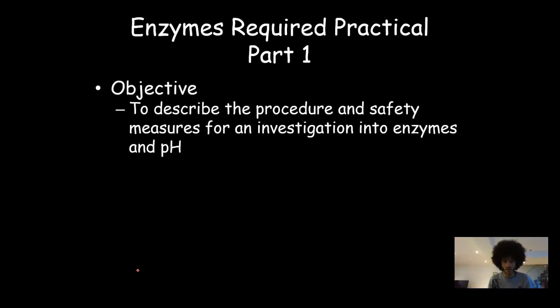So I am going to do this video about the method and the kind of questions that you might be asked about the method. And then in a future video, I'll talk about data and analysis and how you deal with all that kind of stuff. So today, I'll just be talking about the description of the procedure and to some extent the safety measures for an investigation into enzymes and pH. Now, pH is not the only thing I'll be talking about. I'll also talk about if you want to change temperature as well. It's just sort of a flipping of the different variables that you could encounter in this experiment.